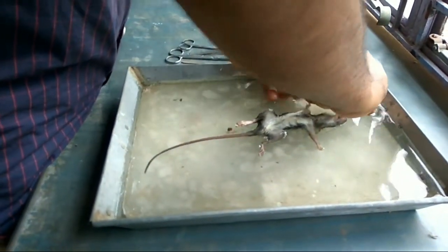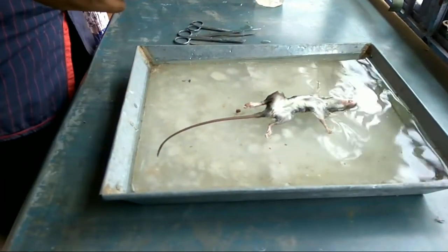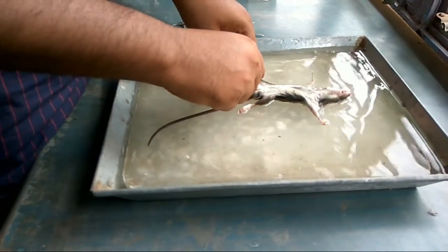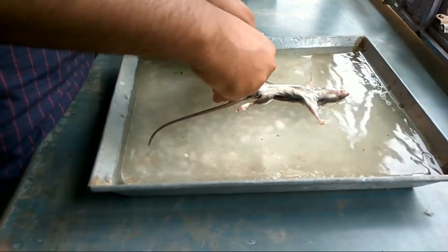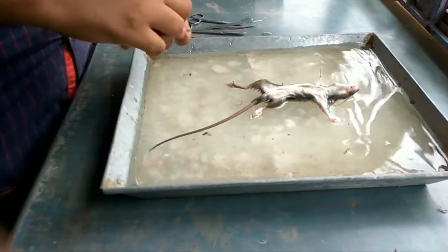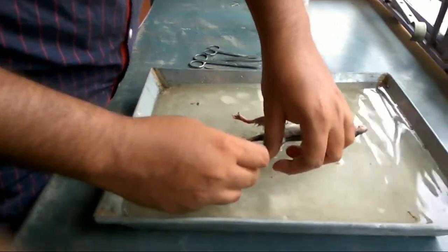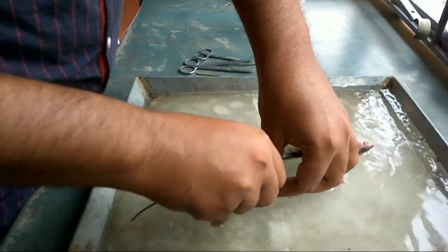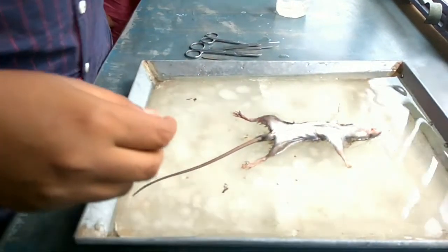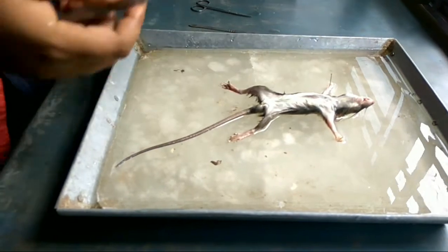Try to stretch the limbs and pin them down in the paraffin of the tray. For your information, the specimen was killed by my neighbor using a mechanical trap used to kill rodent pests. I've completed the pinning process.